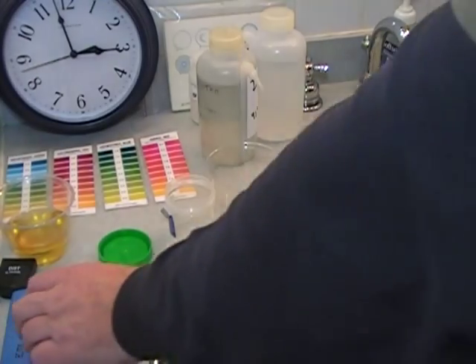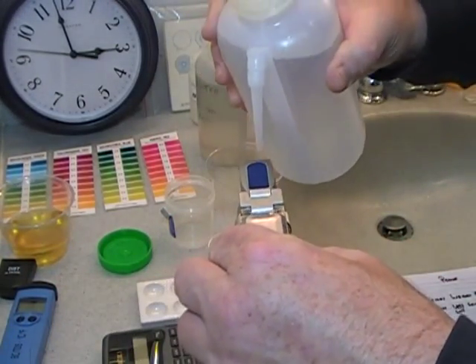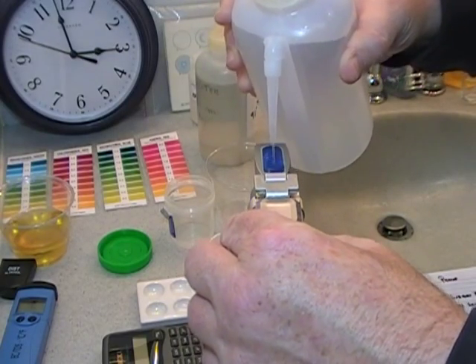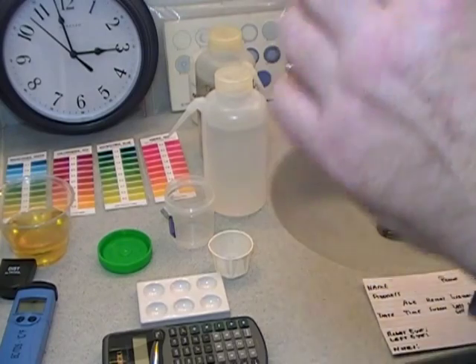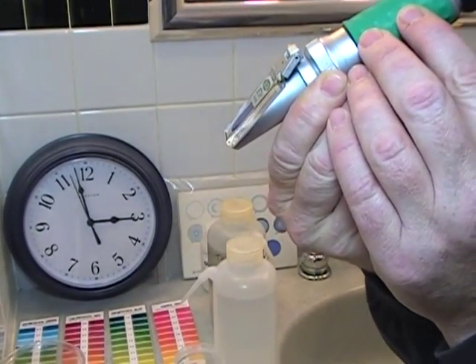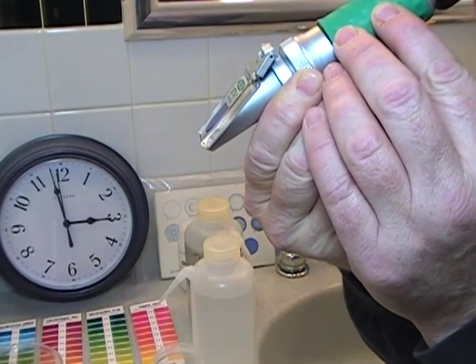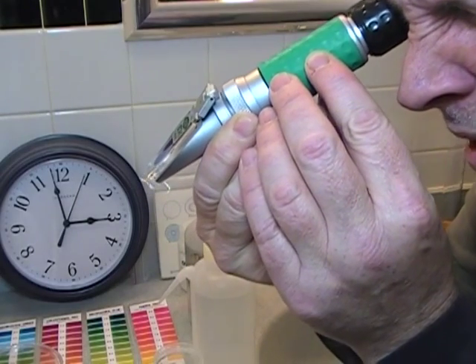Let's calibrate the refractometer. A couple drops of distilled water. Calibration is dead on zero — complete.